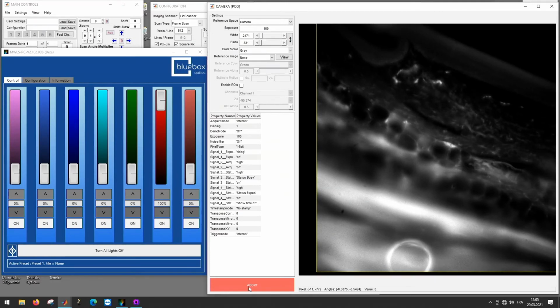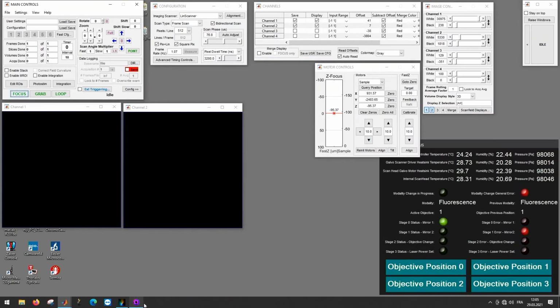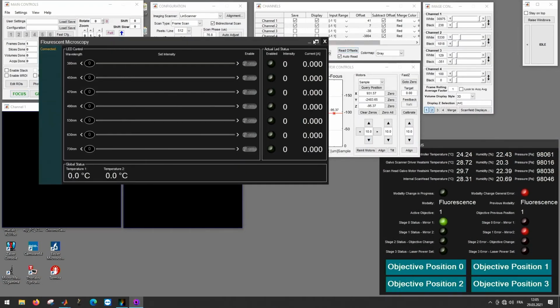Okay, so this was the single photon imaging. I will turn off all of the LED lights, and then we can switch into the multiphoton imaging.